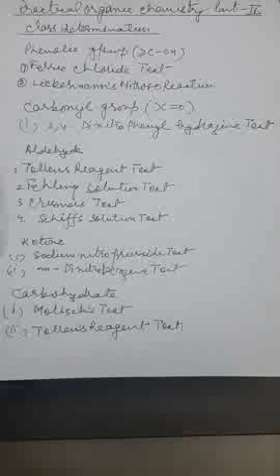Another test is the m-dinitrobenzene test. In a test tube, mix finely powdered m-dinitrobenzene and a small quantity of the substance. Add excess of NaOH solution. A red or violet color appears, which fades on standing. Benzophenone does not respond to this test.